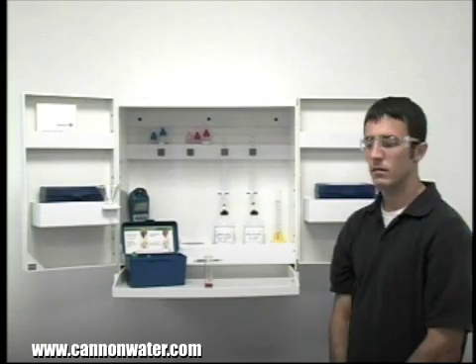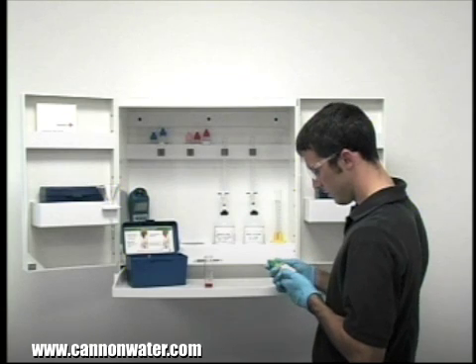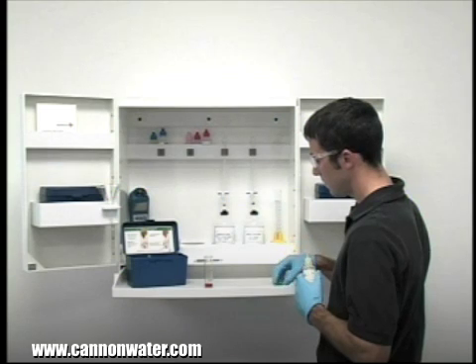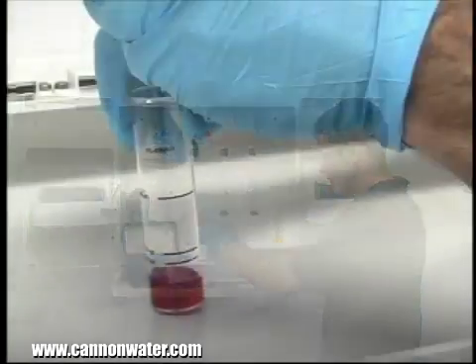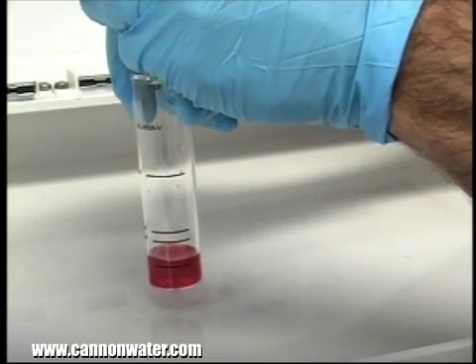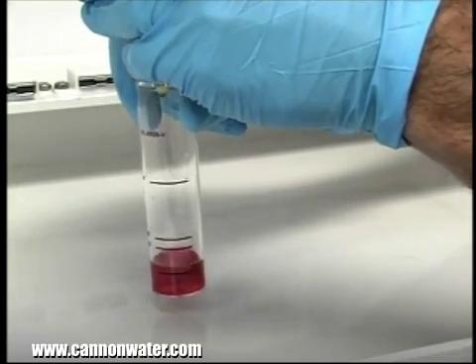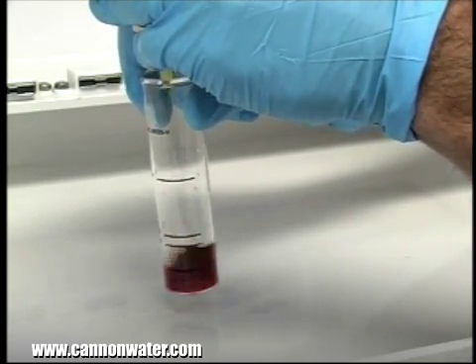The next step according to the endpoint ID procedure is to perform the titration. Each bottle of titrant is labeled with the equivalency and sample size it was manufactured for. It's important to make sure you have the proper titrant and the proper sample size for this titration. The bottle of titrant contains a dropper tip, therefore it's important to hold the bottle vertically to make sure you get a consistent drop size. After the addition of each drop of titrant, you want to swirl the vial to make sure the sample is properly mixed.